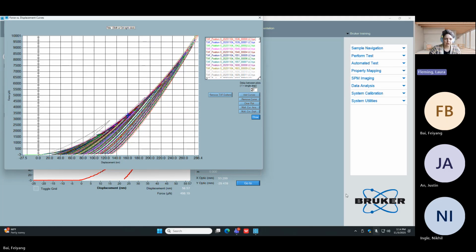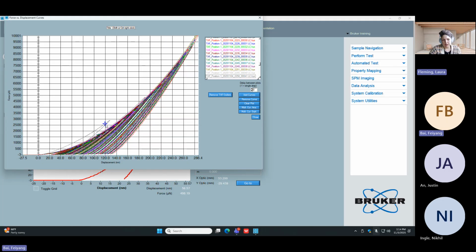Yeah, really nice, really repeatable. Oh, one outlier out of 200 indents. I'll take that. So do you want to click on that one that's obviously not supposed to be there? The one whose loading and unloading do not match. So that probably hit a piece of debris or some sort of scratch in the sample. Something happened, but position 1, number 41 is probably an outlier.